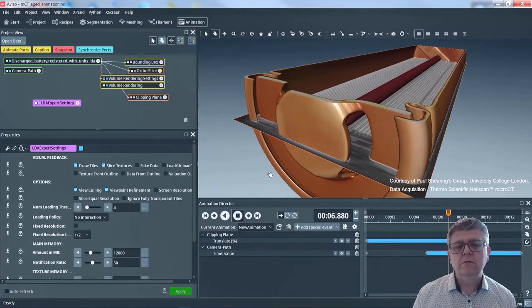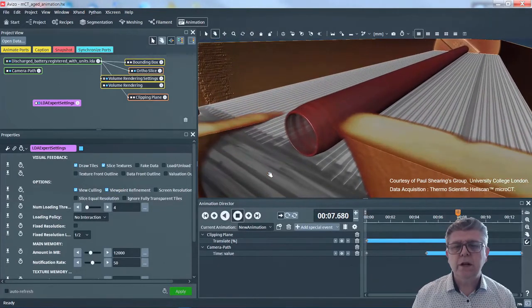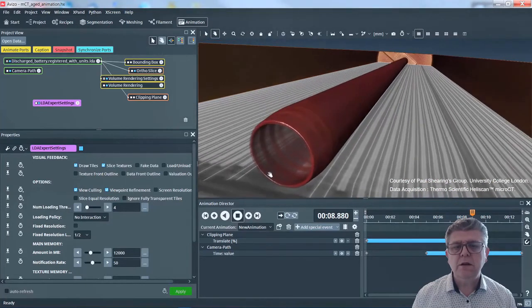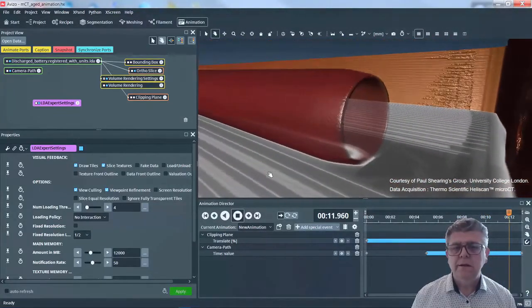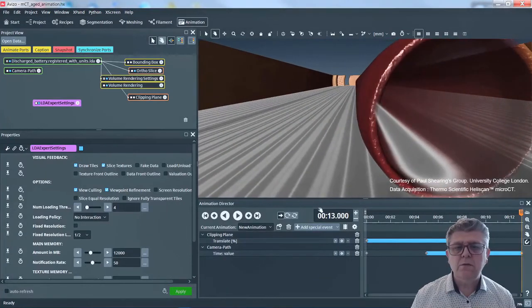Maybe it's not a very useful video, but it's nice to check if my quality settings are good or not, because you constantly have something near the camera, something far from the camera. And this movement is very fast. So I want to be sure that my quality of volume render is always nice.